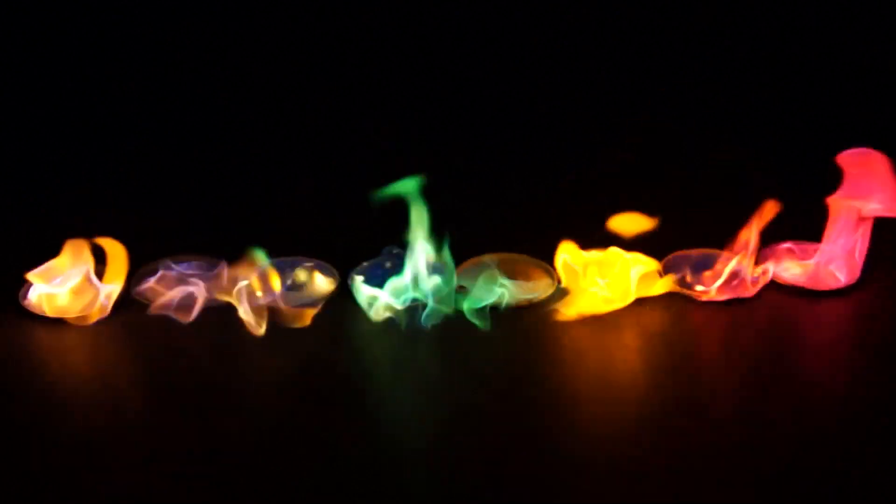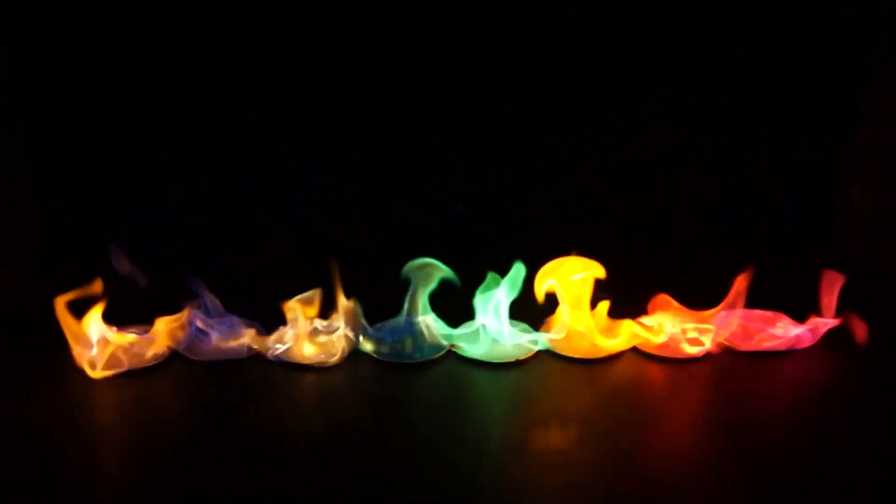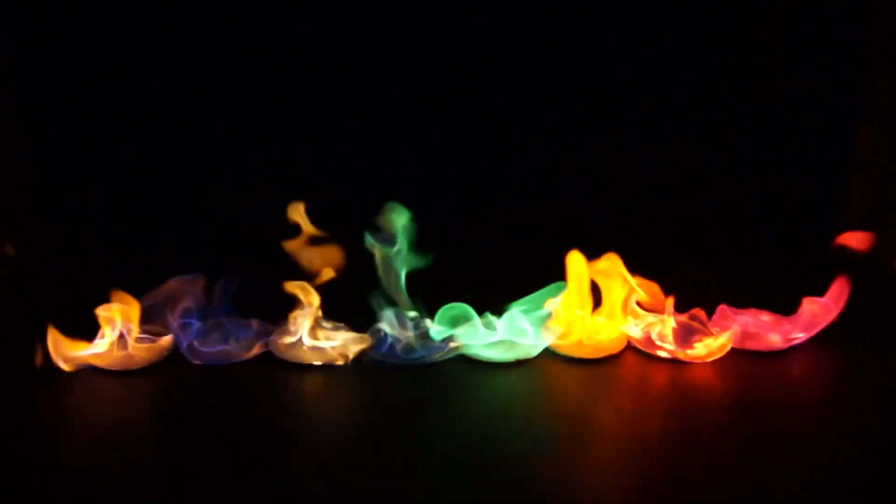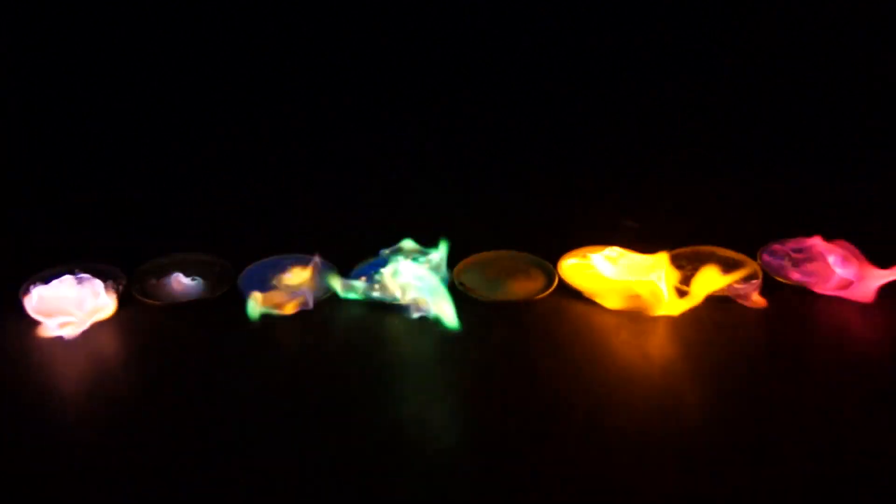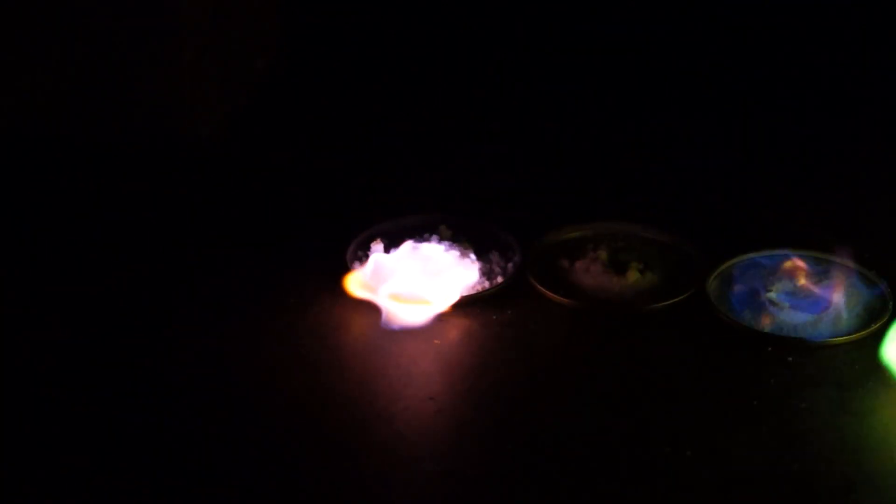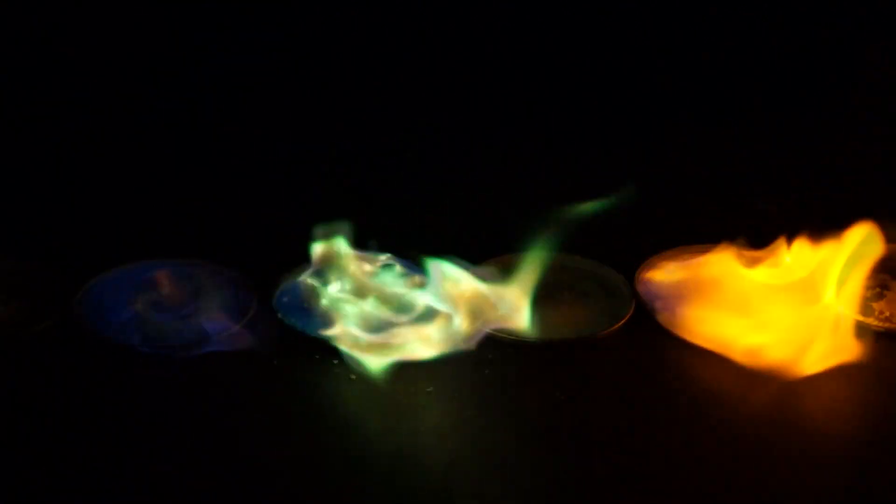At the end methanol slowly burns down and the flames are reduced. Now we can see more clearly how different salts paint their flames. For example, potassium chloride which previously was almost yellow now became more purple. Copper sulfate has also become more green. After methanol is burned the experiment stops.